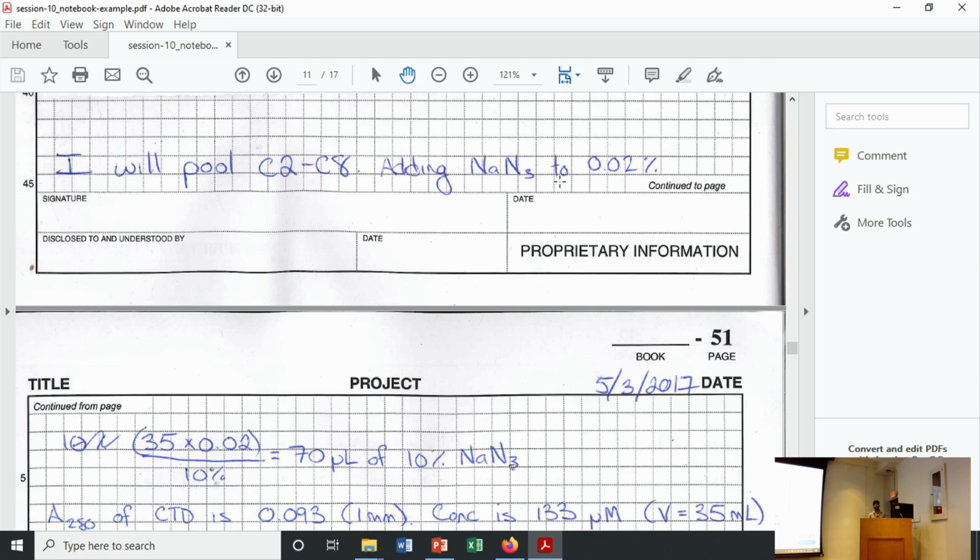So from all of these, you can see what are the things you have to do whenever you are working in the lab. Especially whenever it's related to your research, what are the things that you have to document, and whenever you come to a conclusion, it's better to write it there. And if you got some unexpected results, you have to write that too. That I didn't get these results, and you can write down why I didn't get that result. So from all of this session, those are the things that you can take away, and that's all I have. Yeah. Thank you.